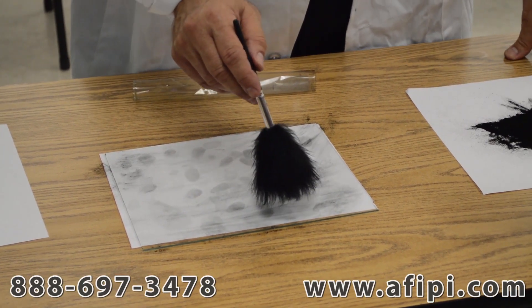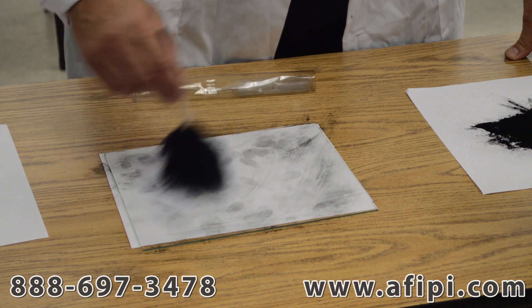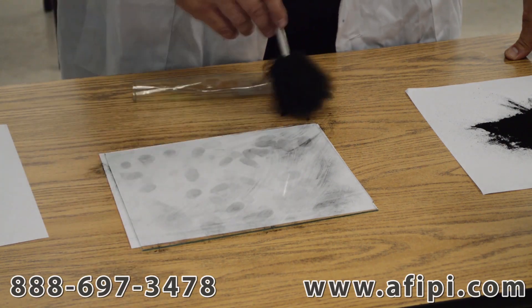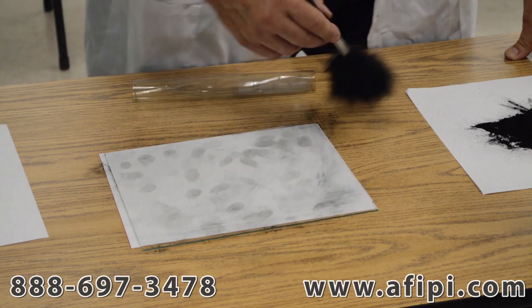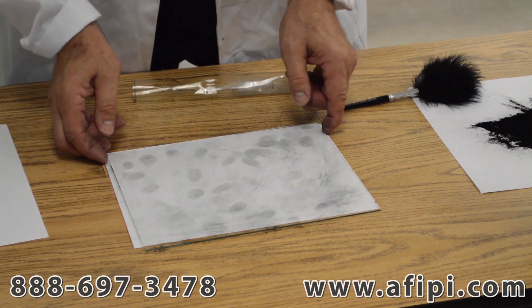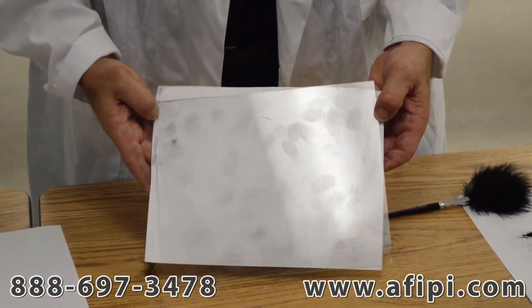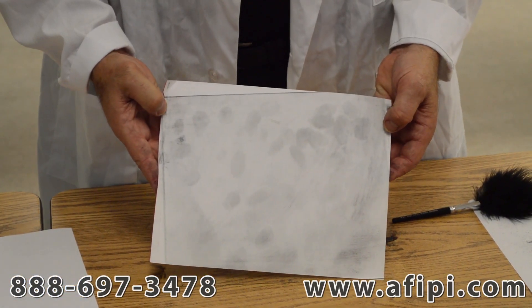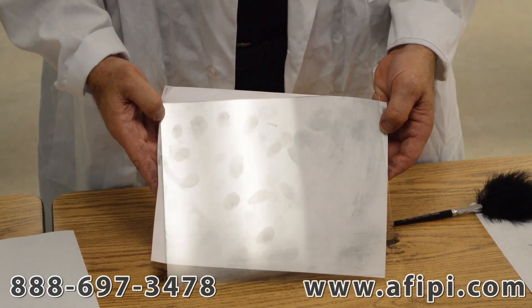I hold my brush about a sixteenth of an inch to a quarter of an inch away from the surface, and I fan to get the excess fingerprint dust off so that it's clear of the seam. I will tilt this up so that you can see better. These are the fingerprints that were developed from those four basic strokes.